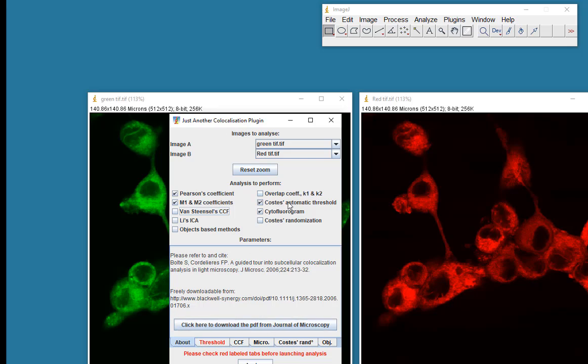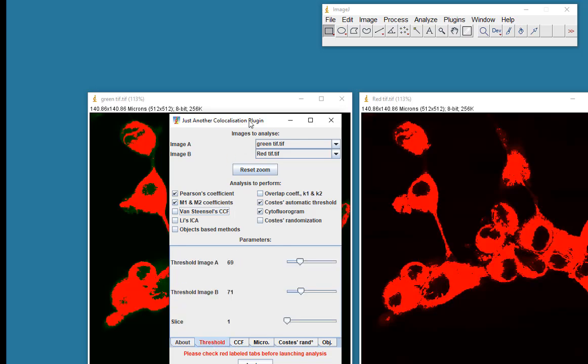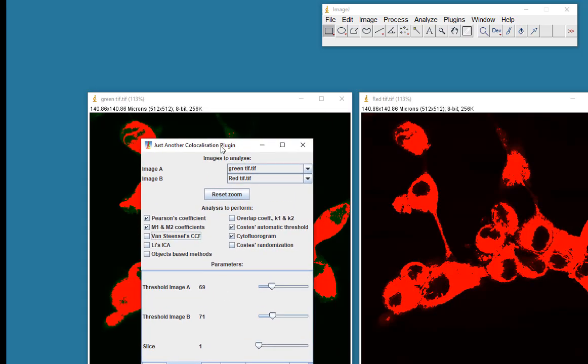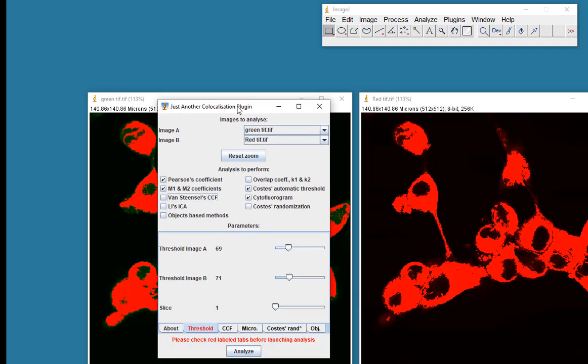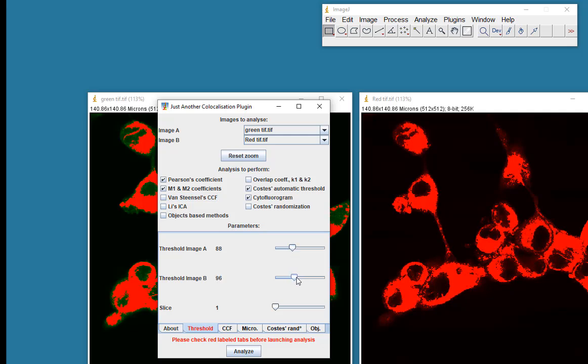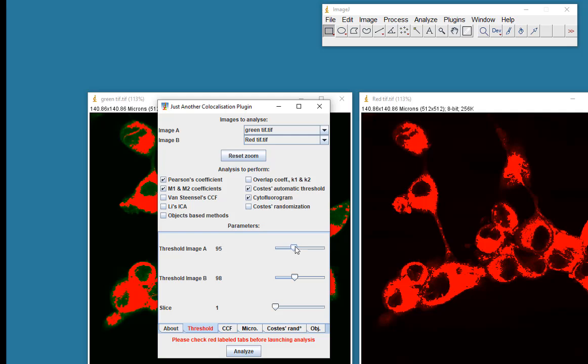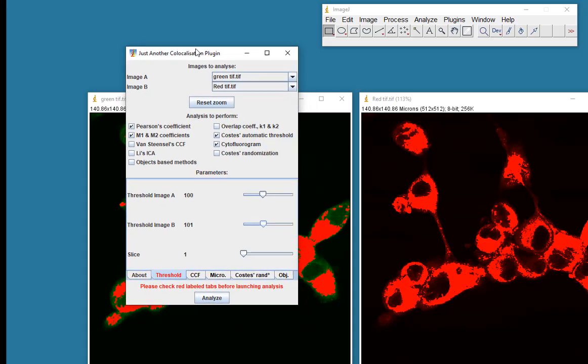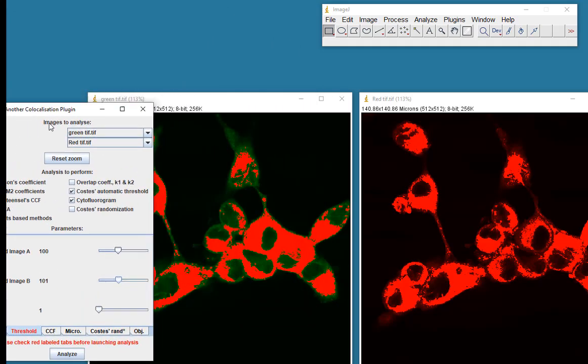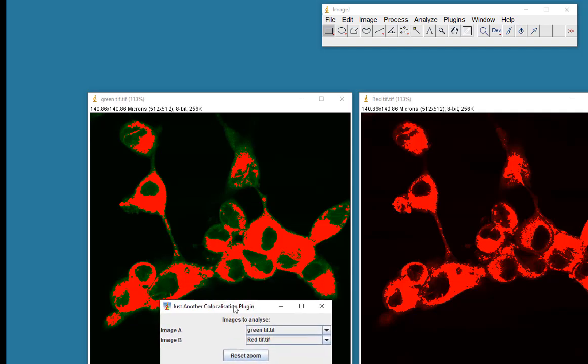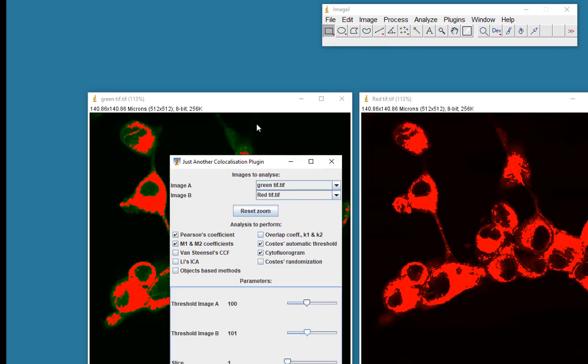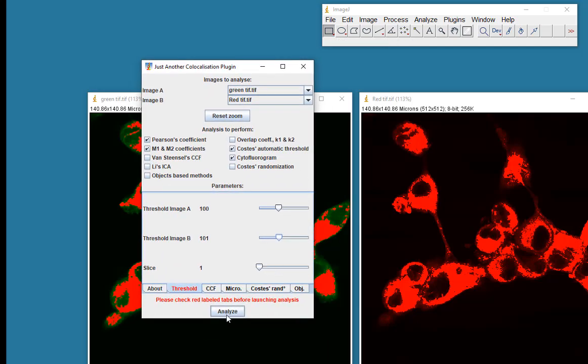So if I'm using the Costas automatic threshold, the algorithm will guess at what it thinks is a good threshold. I could, of course, alter that a little bit if I wanted to. And that's up to you. Probably best to make them both the same. I'll make them 100. I'll just go with that 100 and 101 just for the purposes of showing you. So what I will do here is I will measure the co-localization only under the thresholded region, and I will analyze this.